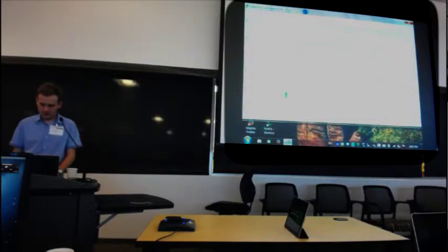Run template. Also, what about the first line? Directly where the analysis is taking place? Right at the top. Yeah, we had that already. This one, base div. We'll check that already. And you should also have changed it already.